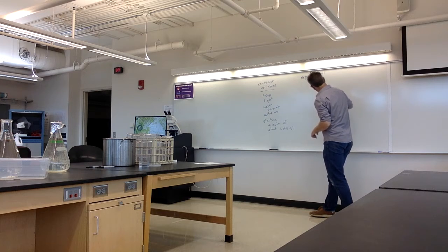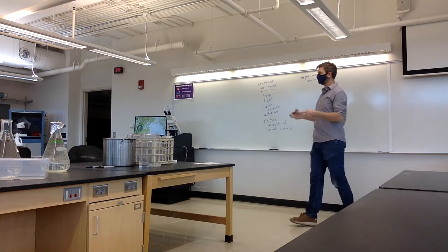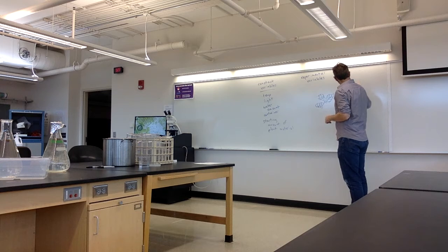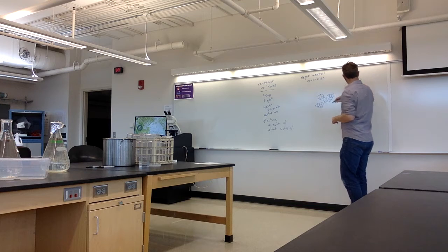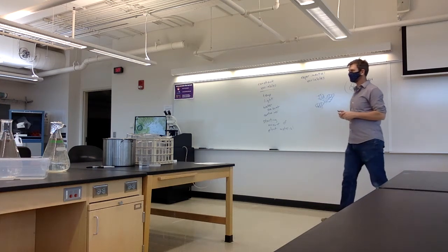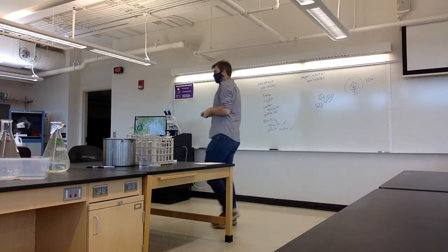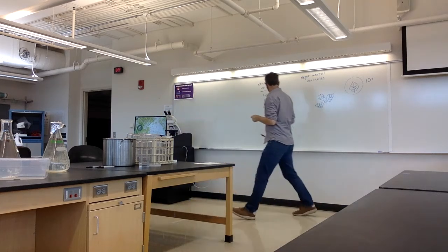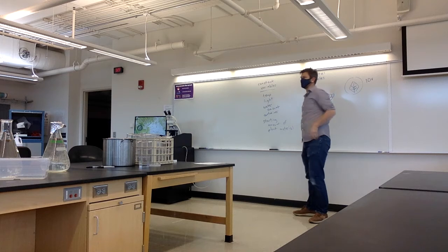And you might have a few of those all still connected. So we could try, my initial thought was like try to get one of these each and try to get 10 of those in the container. So maybe back up a sec. How are we going to measure how well they grow? What do you think?